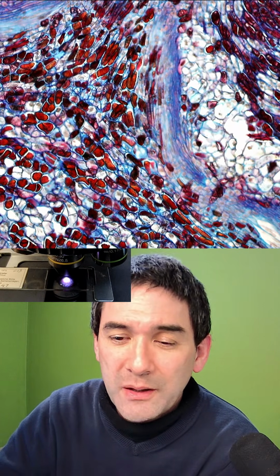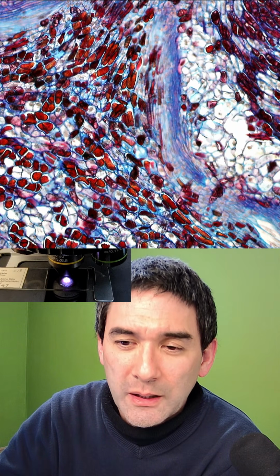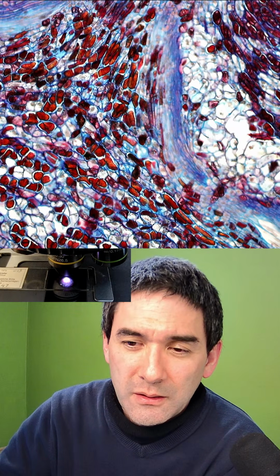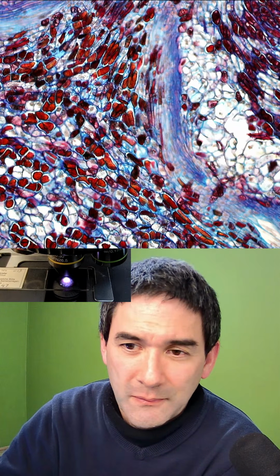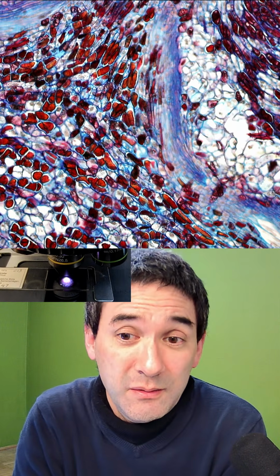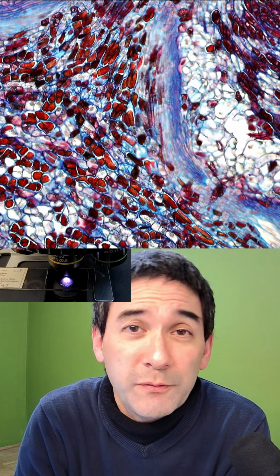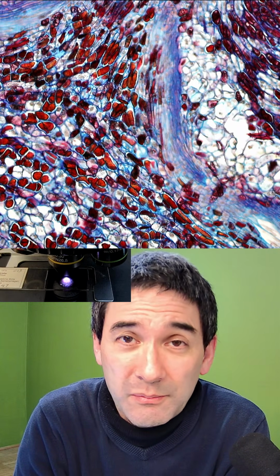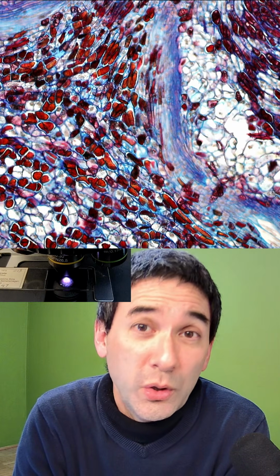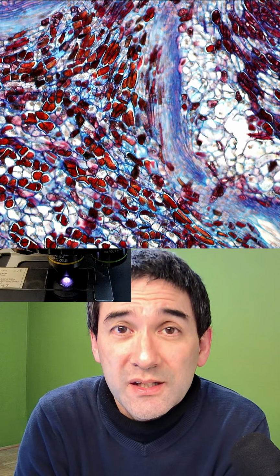What would be the best mounting medium to secure 5 specks of shiny metal in a deep slide? Oh my gosh, shiny metal in a deep slide. I mean, generally, I don't know what the best is, but what I usually experiment around with, before you get any special mounting medium, is to use PVA glue. It's water-based. This seems to work quite well in most cases.